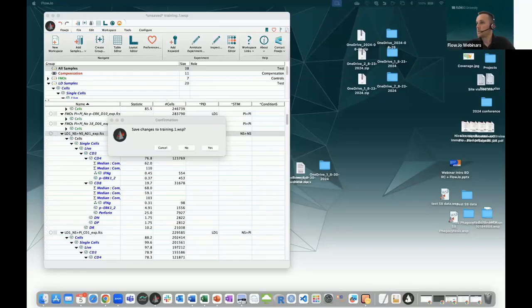Any other questions? We're way above the hour normally allocated for this training, but happy to keep going. I have an issue with slowness during the analysis. What is the best configuration for FlowJo? The minimum recommended, I think, is an i7 and 8 GB of RAM. I think that's now the minimum recommended for FlowJo.